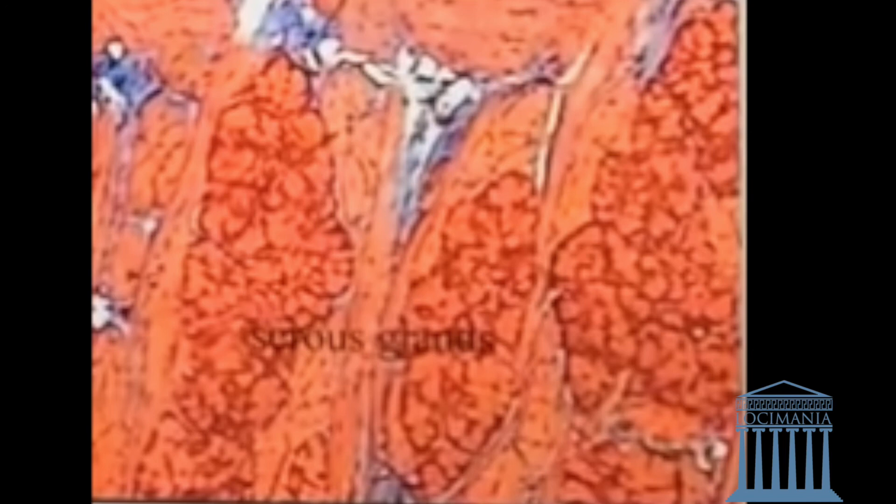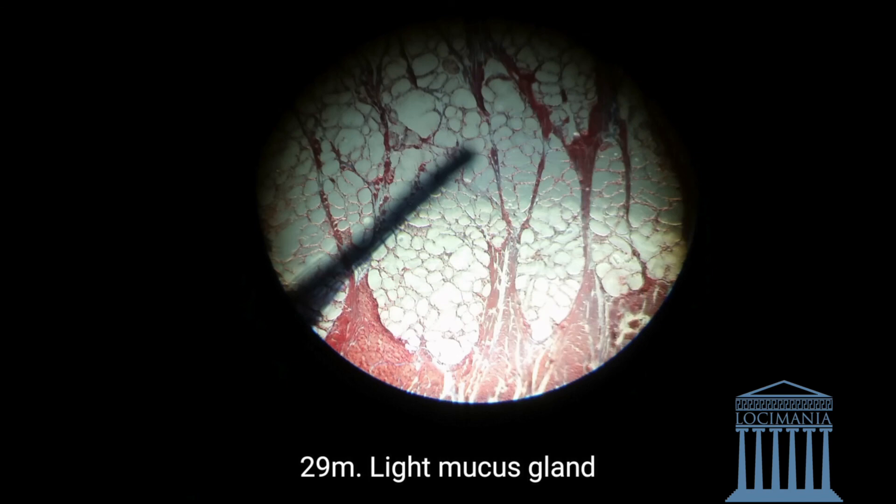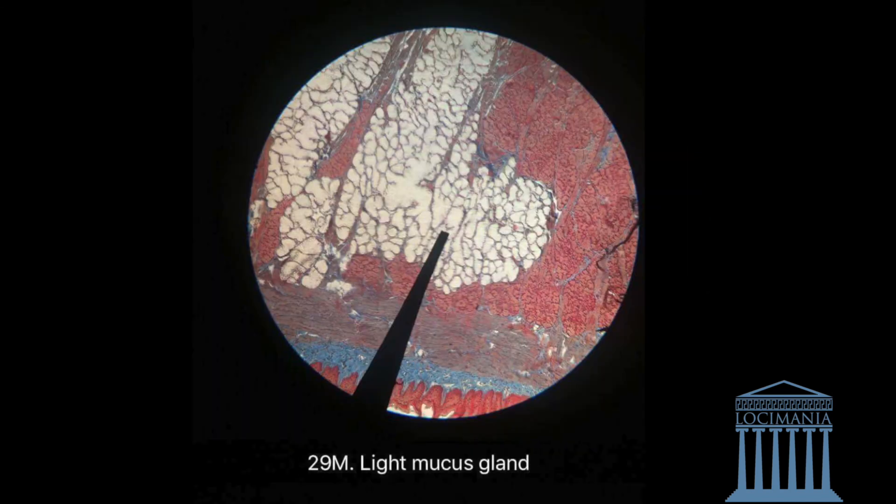I'm going to show you two specimens with the light mucus glands — they're really easy to distinguish. Here we have the light mucus glands of one specimen, and here we have another specimen showing them as well. That was all. Thank you, and please come again.